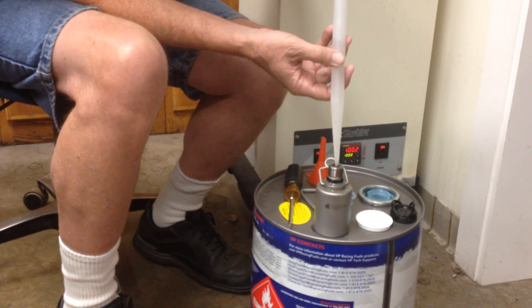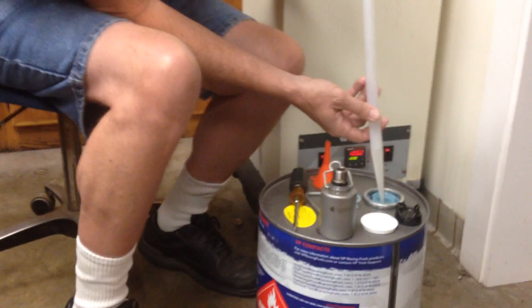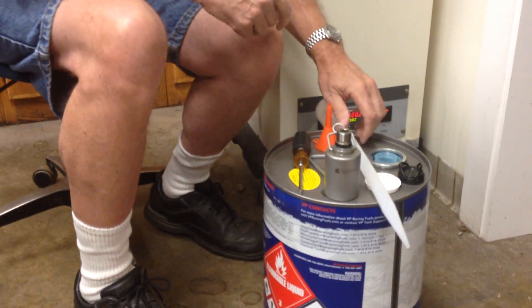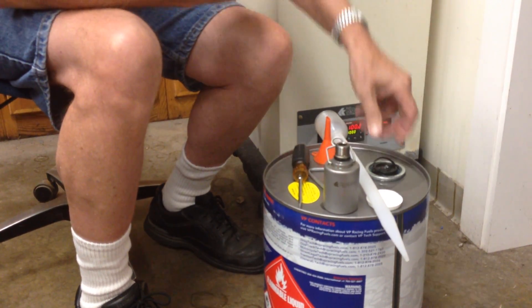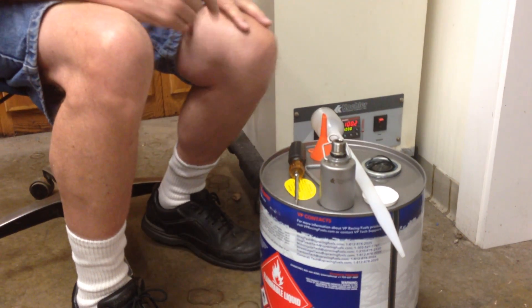What we're finding is often the fuel coming out of these sealed pails is stale, before we even open it up. And what we don't know is how this fuel was stored before it was transfilled into these small containers.